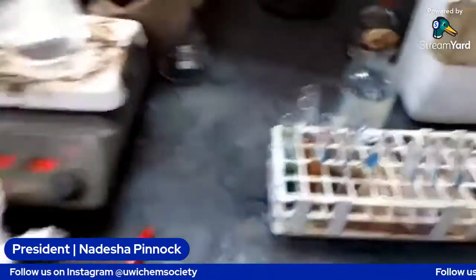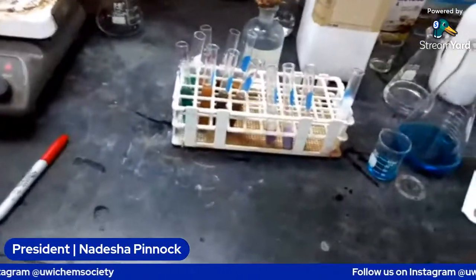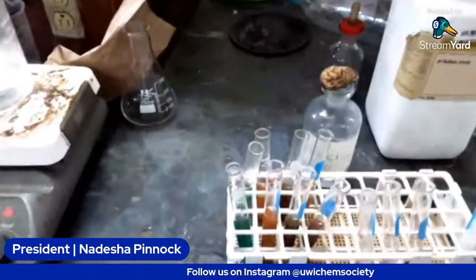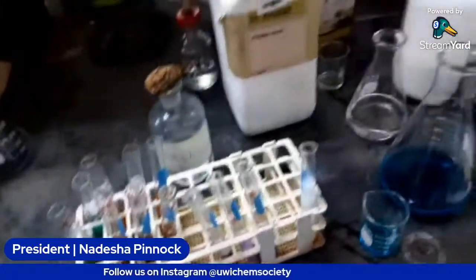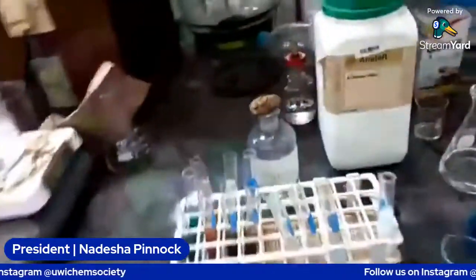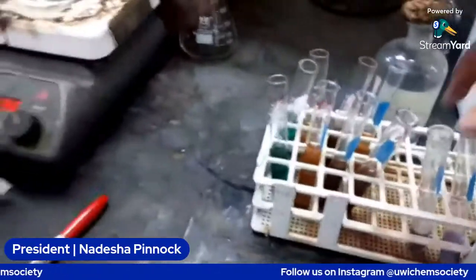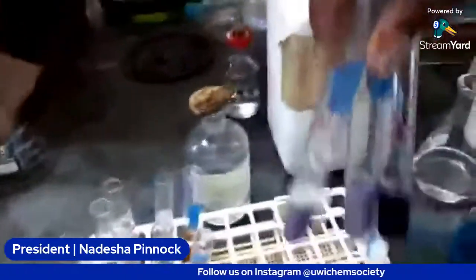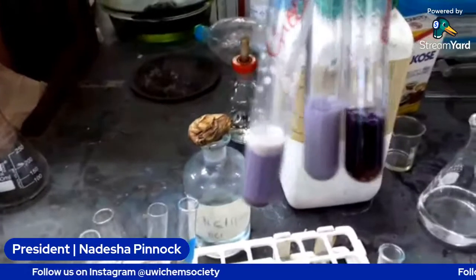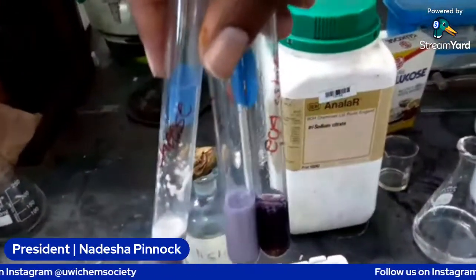So again, we're going to do the sugar, and you want the syrup again? The syrup and some fruit juice. So again, these are the tests from the Biuret. We let them sit. The one on the far left is the cheese, as you can see on the labeling.